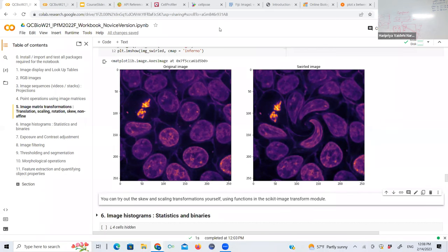Yes, this is an important point that I could bring up. You can't technically go from an 8-bit to a 16-bit without upsampling, so we have to interpolate. So the order totally matters. When you downsample and you lose data, you can't get that data back. But for float, it's 64-bit, so you get sufficient accuracy to actually store it. And the range is from 0 to 1, so you're not really doing much to it. Because you expect it to give you artificially higher accuracy than you really have.